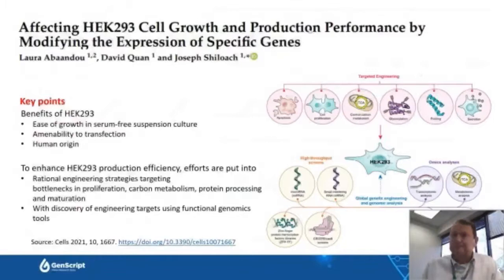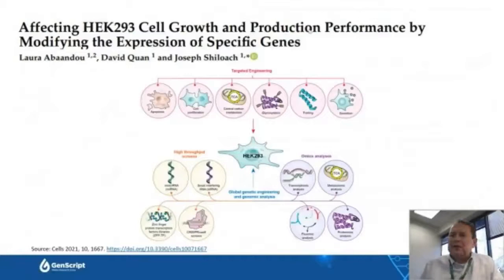One of the things that is required is the ability to do high throughput screens. So if we have to look at many plasmid variants to find the optimal virus or the optimal AAV that increases its targeting ability, or what they call tropism, using the present pseudotypes, it's important to screen through these in high numbers. And that cell culture has to meet that demand. So we are looking at putting robotics not only behind the plasmid, but behind the culturing events. And that requires a lot of various types of genomic analysis to verify that there is DNA in the capsid, the capsids are well formed, and as well, those analyses also have to be done in high throughput right alongside the production.